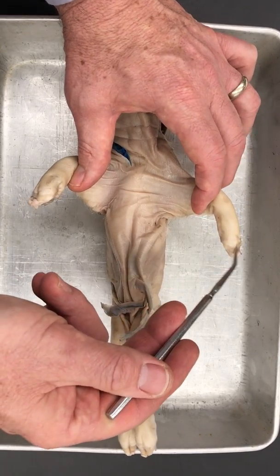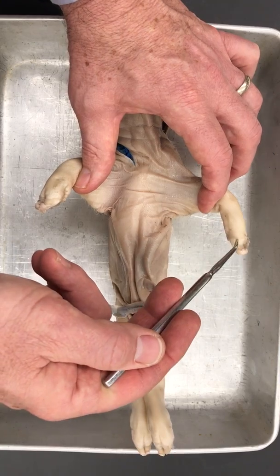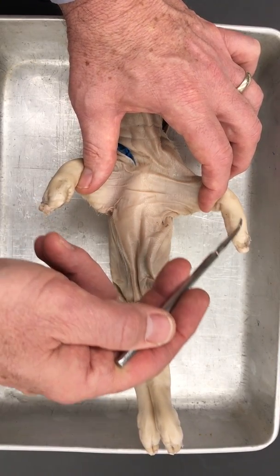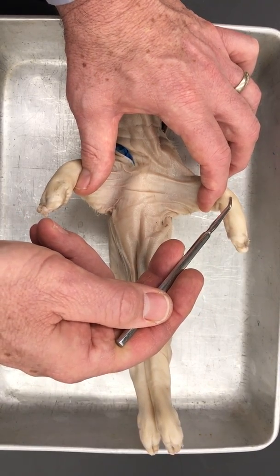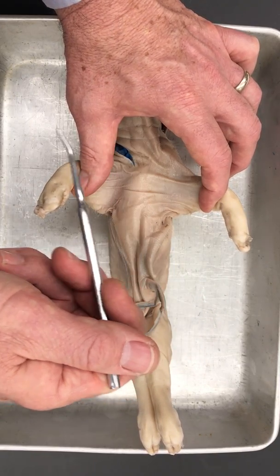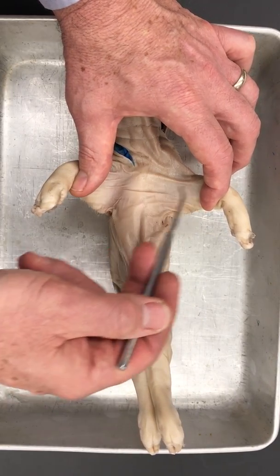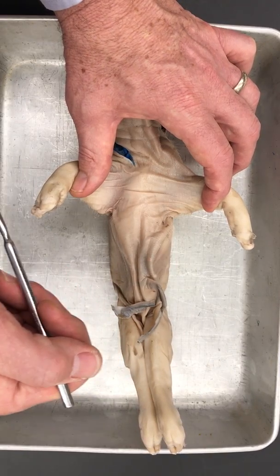So if we go out here, here's this pig's toes, its digits. The digits are lateral to its wrist. By the same token, this is medial to its wrist. Okay? So we can also talk about proximal and distal. So proximal means close to the midline. Distal, hear the word distance in there, so distal from the midline.